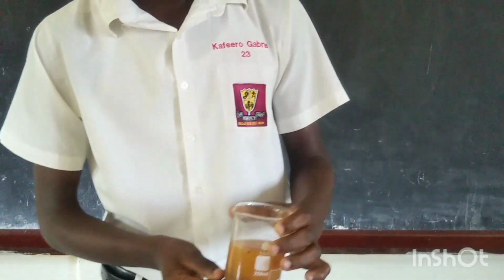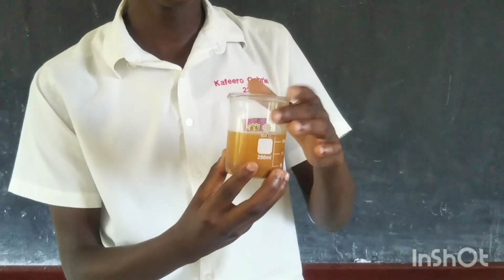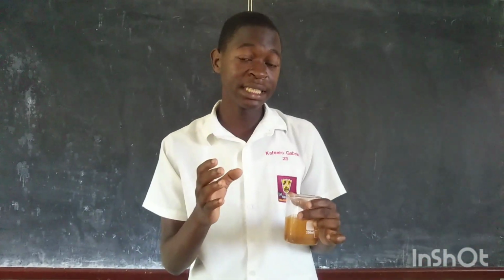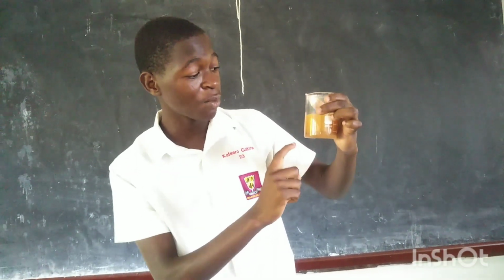So here I get my mixture of sand and water. But when you are adding this water into a beaker, make sure you add it gently and carefully, to prevent the sand from rising out and mixing again with the water, because now it's separated. As you can see, here is the sand and here is our water. So I'm going to pour it into my empty beaker for the final result.